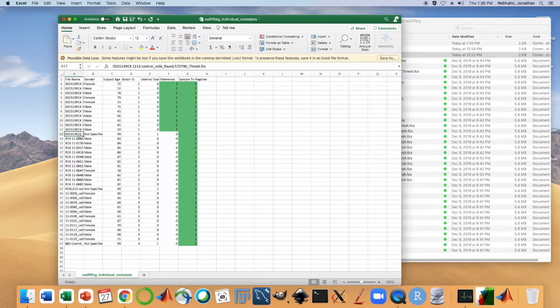internal standards or internal controls, then you'd still want some way to represent the consensus for that particular batch. So we would simply take this reference sample and indicate all of the samples in that batch to be our reference. This will subset each of those samples and then combine the samples in such a way to create a single concatenate for that batch, which we can use as a reference.